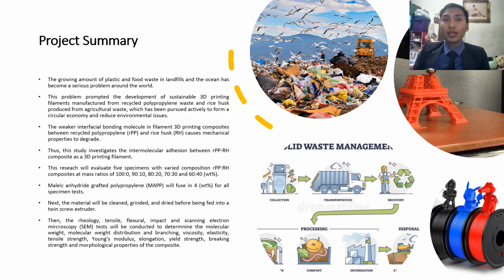So the project will begin with material selection, and then the material will be cleaned, ground and dried before it is fed to the extruder. Then the rheology, tensile, impact and SEM tests will be conducted to determine elongation, tensile strength, tensile modulus, and so many others.